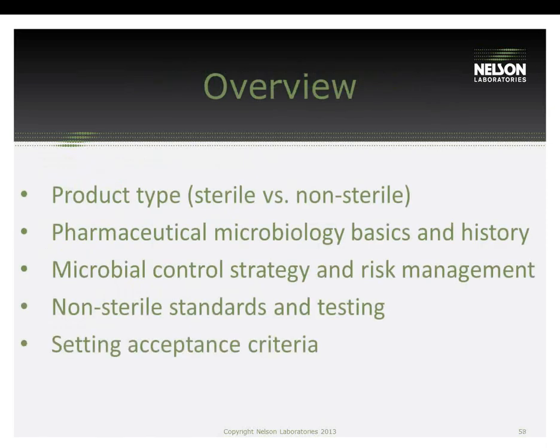So just an overview. Again, we talked about product types, sterile versus non-sterile, the history and basics of pharmaceutical microbiology, microbiology control and risk management, non-sterile standards and testing, and acceptance criteria.